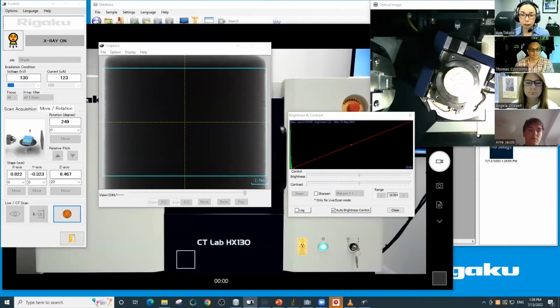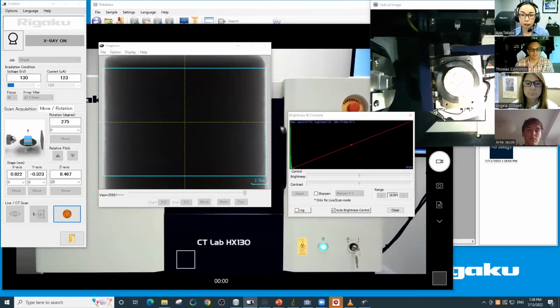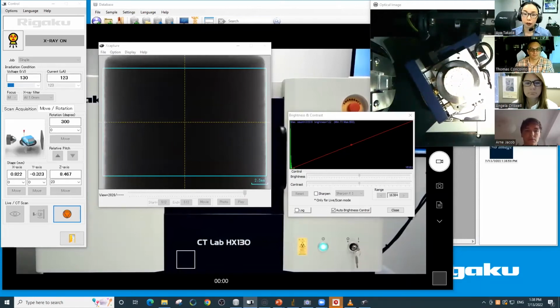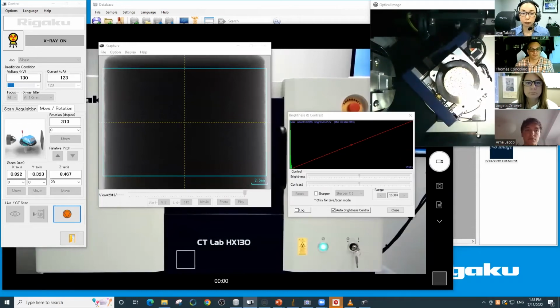And Jing actually asked a similar question about the 5x grain sizes. Do you recommend testing different sections? Can you elaborate more on the representative volume size and making sure that you're getting a representative sample? Just some thoughts on that.